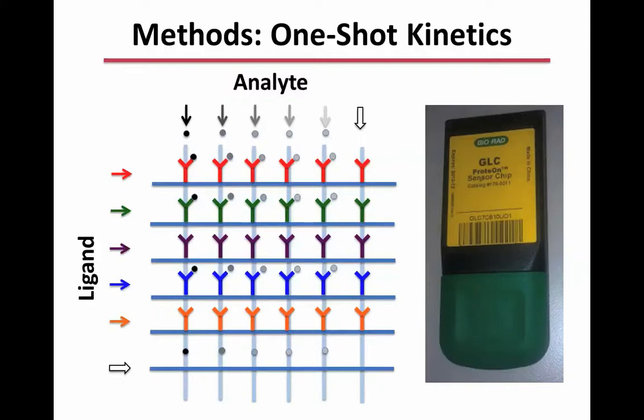And because this is amine coupling, we can regenerate the chips with glycine, and we've had consistent results with regenerating and testing the same analyte antibody combinations. So it really allows us to screen as many analytes as possible against our panel of antibodies.